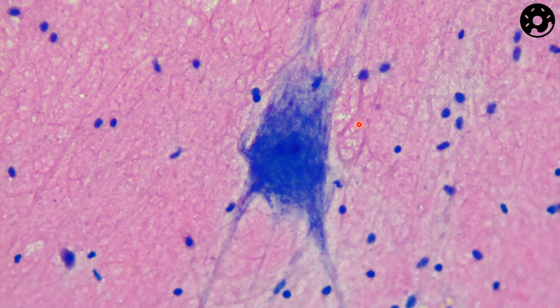Now, the next image that I have here is just another image of, again, a neuron. And look, different booger, different shape. So this large blue booger, again, is going to be that neuron. And this is the nucleus right here. And all of these blue dots surrounding are the neuroglia. And that's all I require my students to know for this.